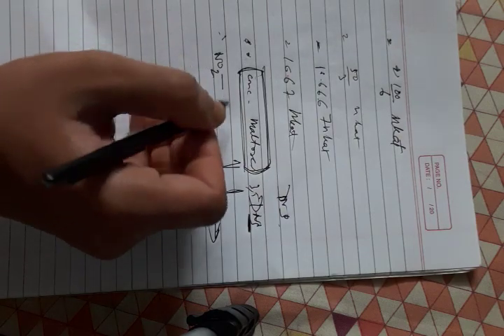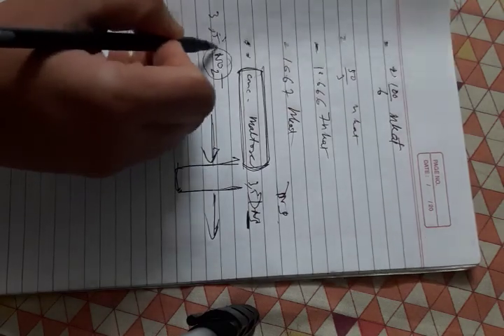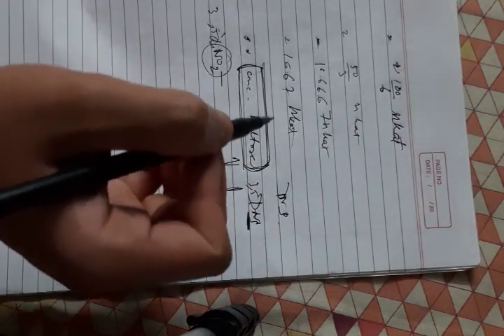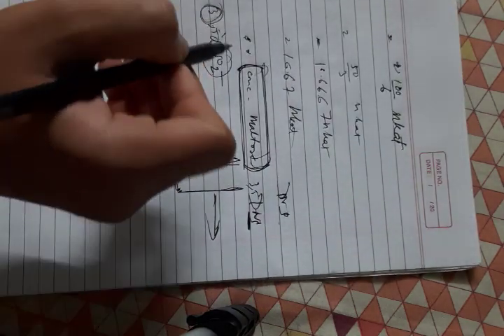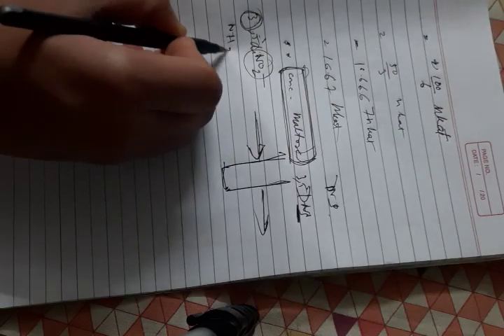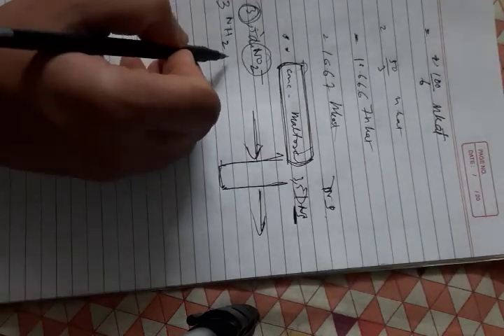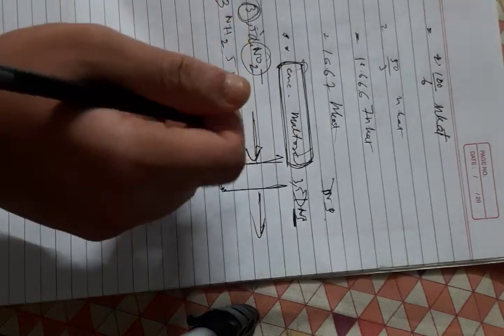Yes, and so this is present at the 3 and 5 positions of salicylic acid, the 2 nitro. When one nitro group is being reduced, the nitro at the 3 position becomes an amine. So it is 3 amine, 5 nitro salicylic acid.